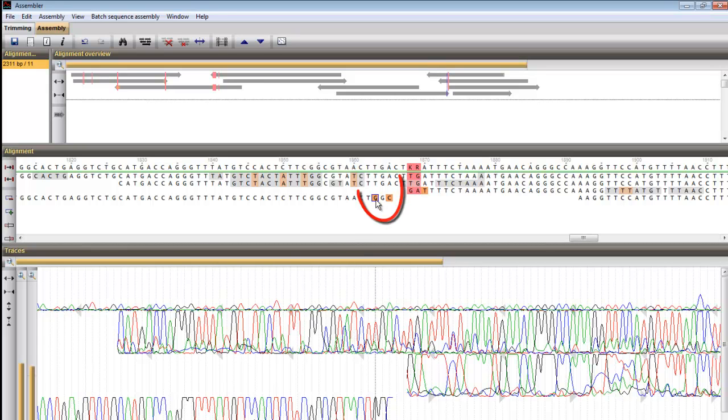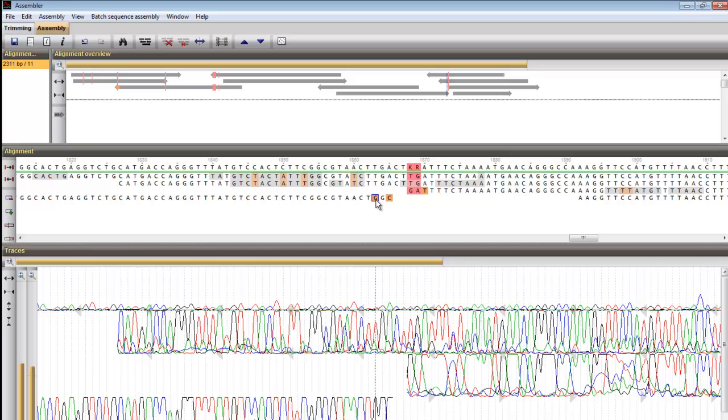The orange color indicates positions where not all partial sequences result in the same nucleotide and the consensus nucleotide was chosen according to a majority rule.